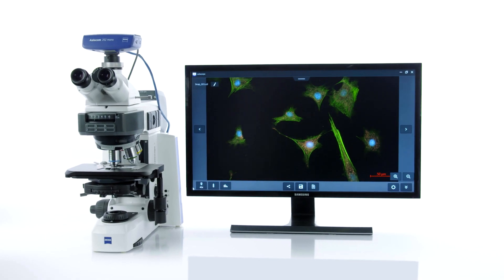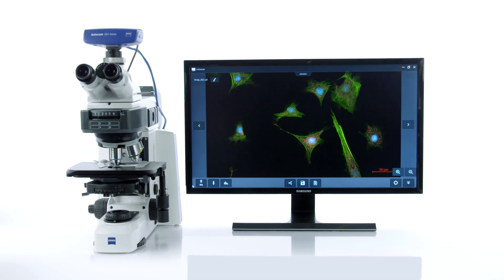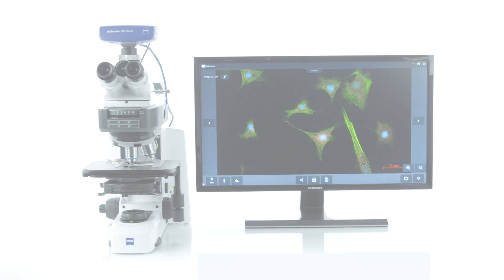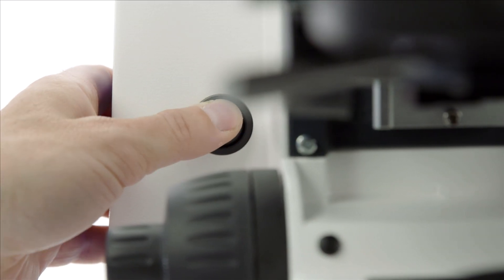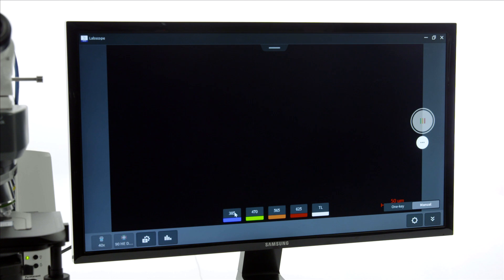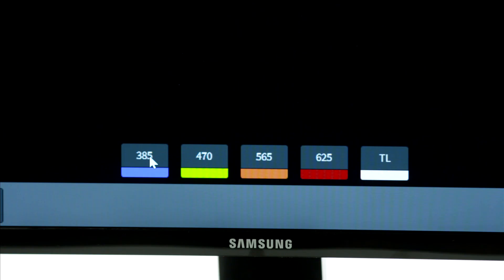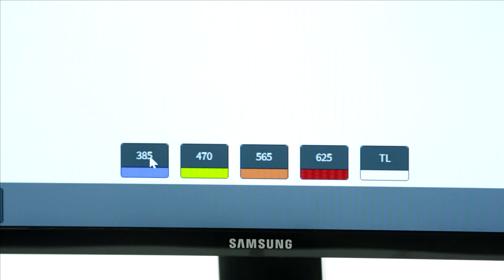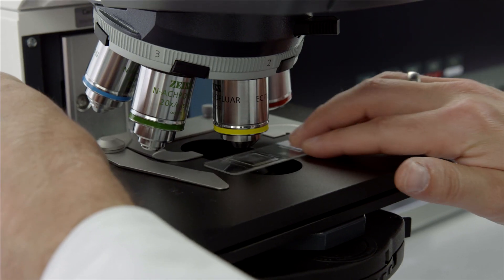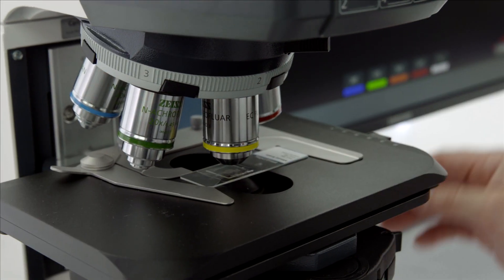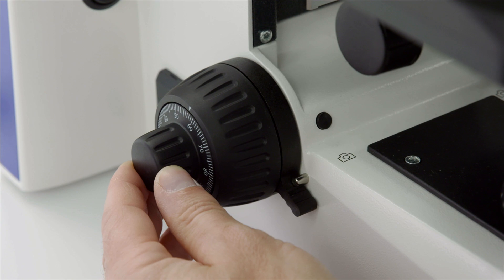Opt for the multi-channel module. Then switch on the microscope and start LabScope. Choose the first fluorescence channel. Place your sample on the stage and focus.